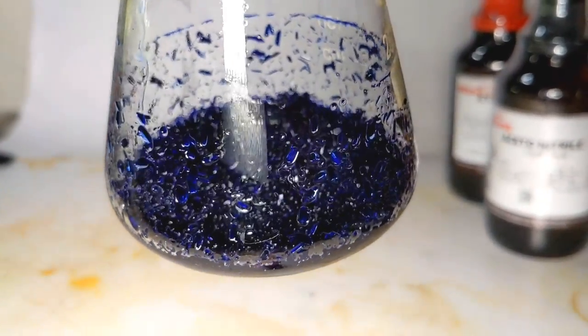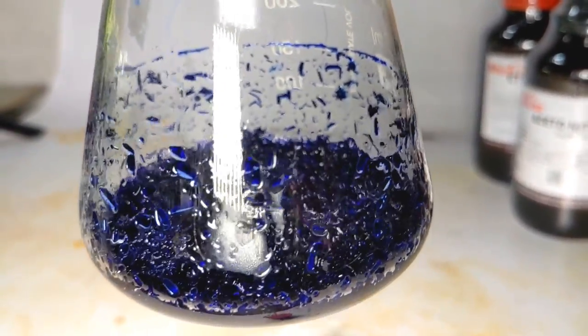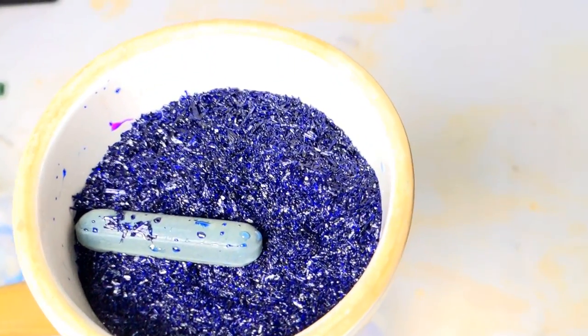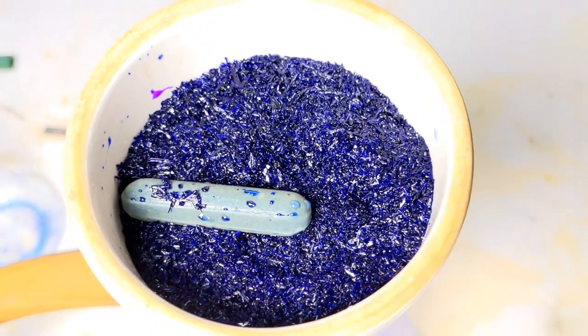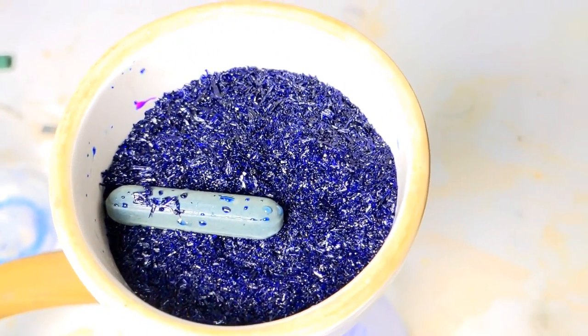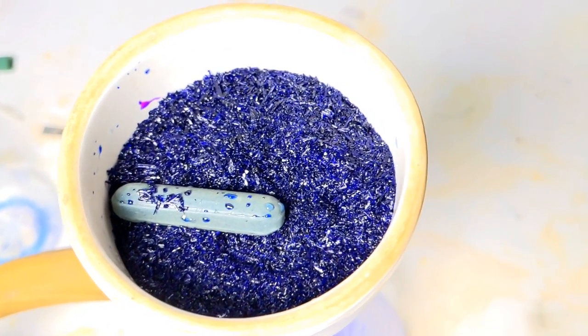It was then gently scraped out of the flask using a glass rod. You can use a little amount of decanted solution to wash down the crystals from the flask. It was then vacuum filtered and washed with diethyl ether for quick drying.